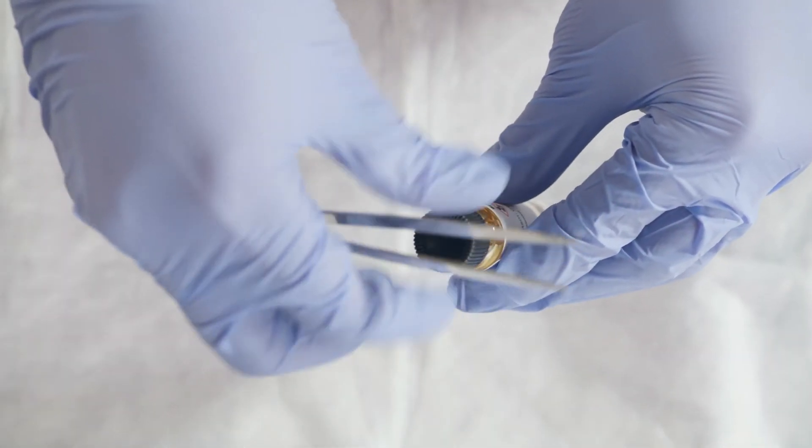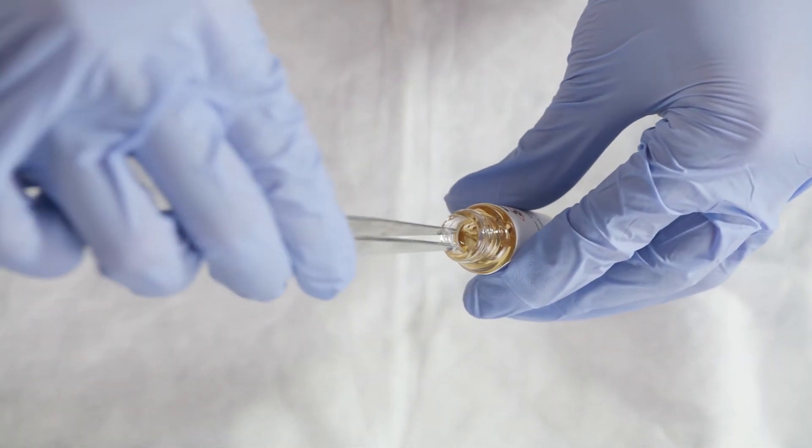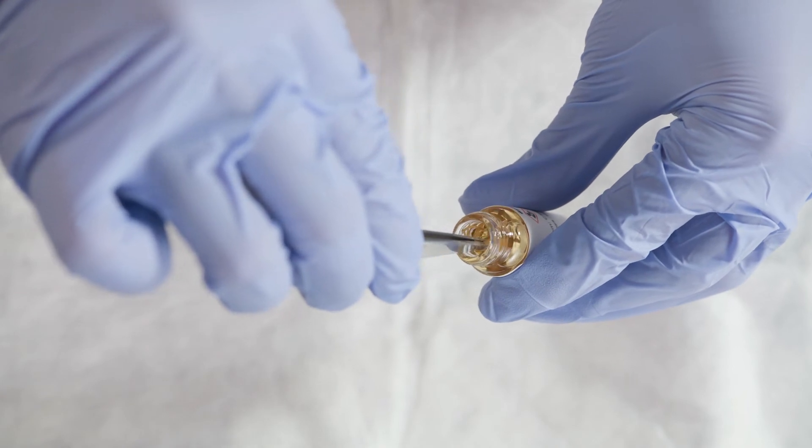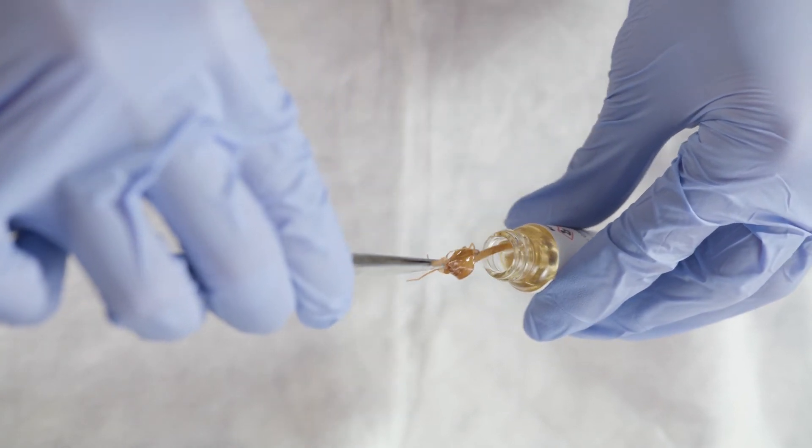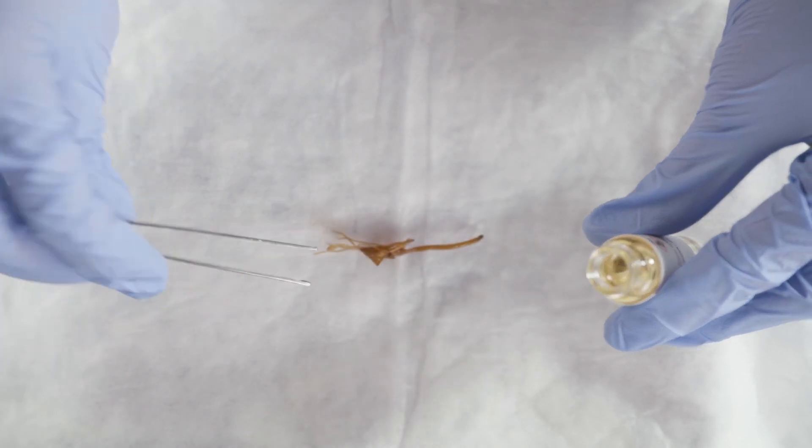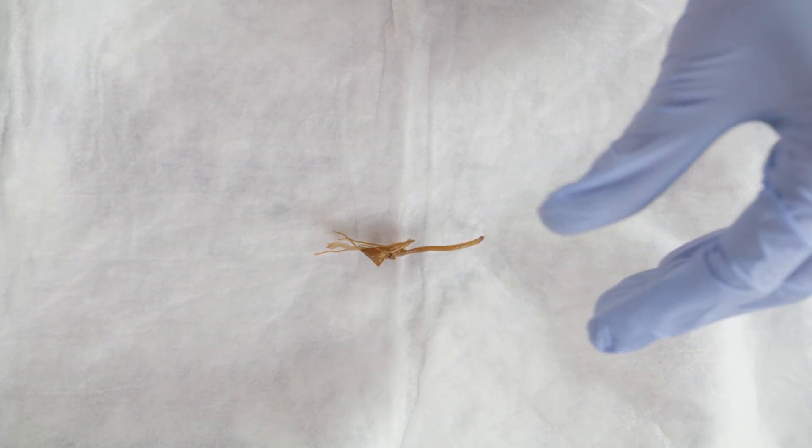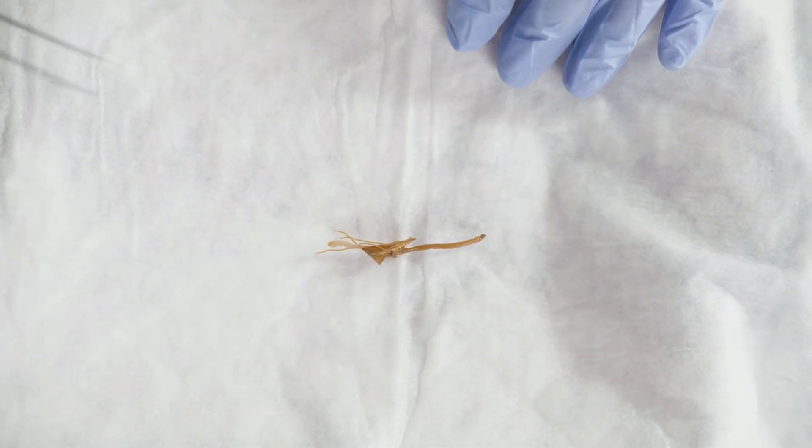When removing a specimen from its container, let it dry on your dissecting tray by allowing the pad to soak up the excess preservation fluid. If the flower is large enough, you can gently adjust it to catch all the excess fluid or pat it dry.